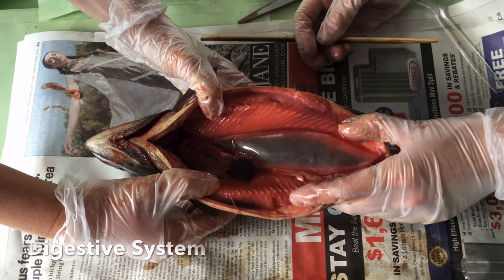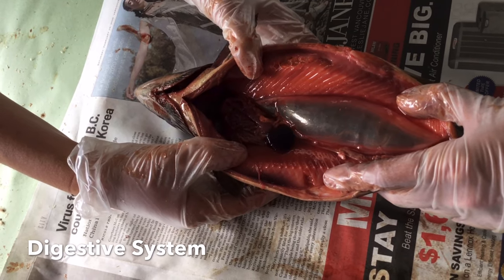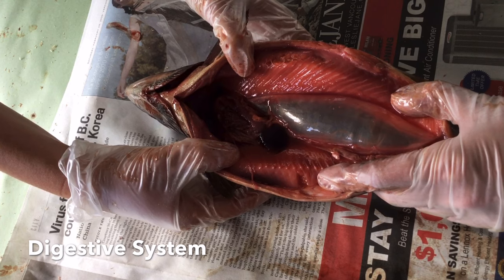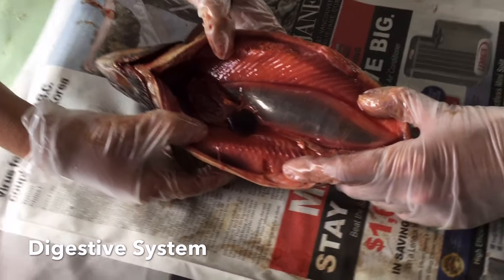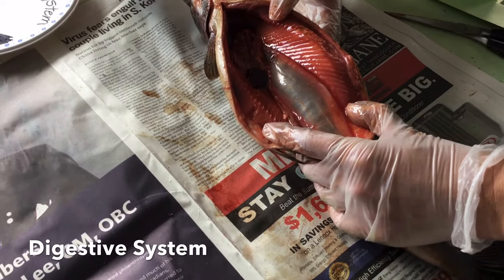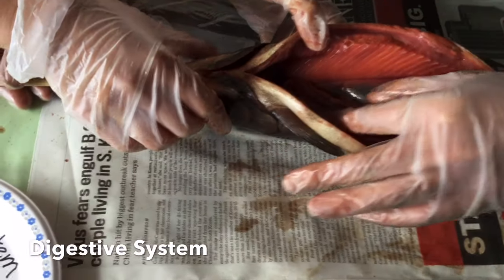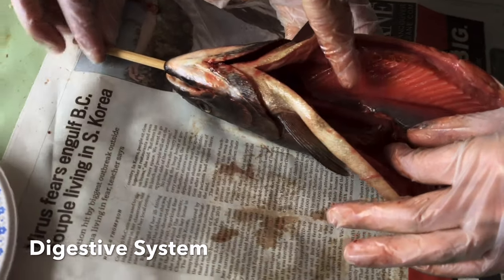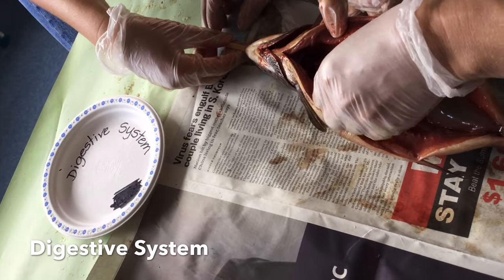Okay, now we're going to move on to the digestive system, and we are going to try to remove all the key components together as much as we can. I think we should perhaps try to remove it. And then we'll go through each part. She'll put this in through the mouth. That's going into the stomach. And now we're going to remove the digestive system.